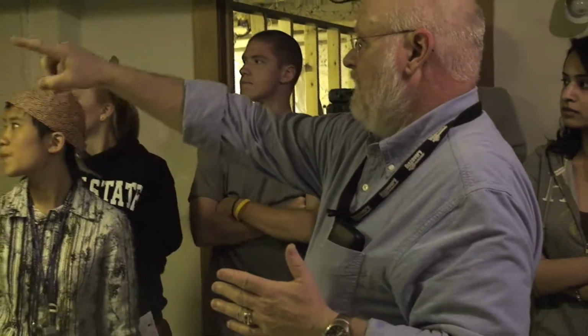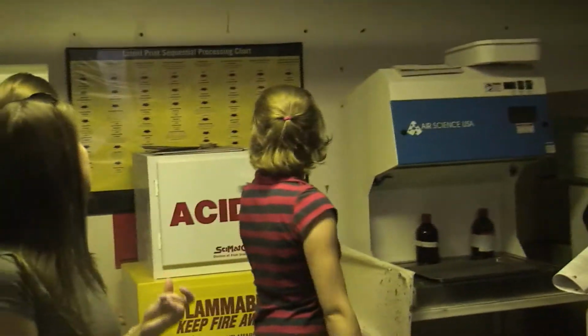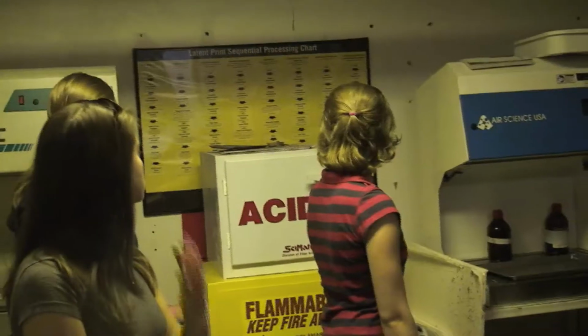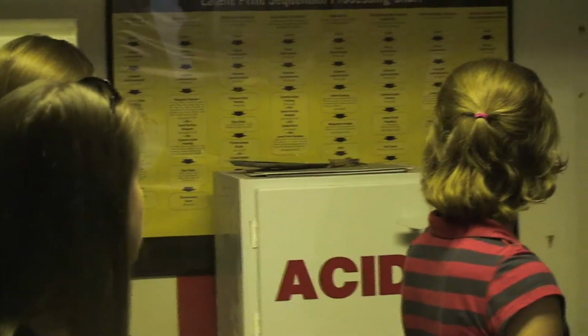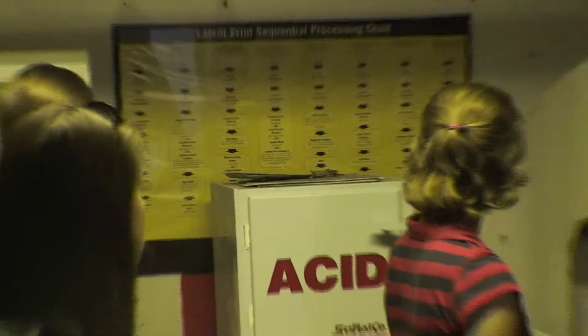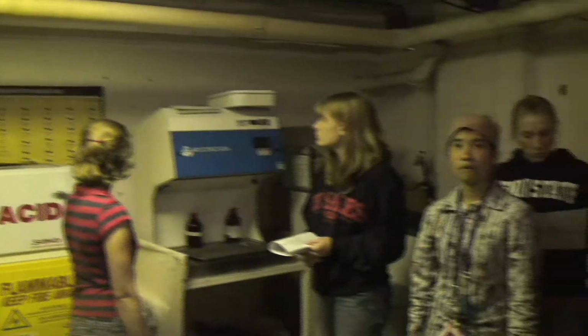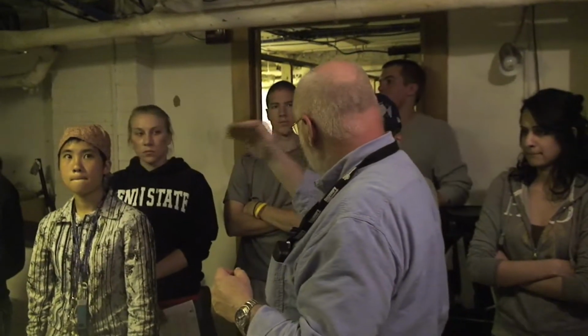There's a cascade that you can use, and if you look on that latent print sequential processing chart back there, you get an indication of the different kinds of reagents you can use for different kinds of surfaces. But generally, for porous surfaces, paper and cardboard, the first thing you're going to do is some sort of visual examination. You're probably not going to see anything, or you might, but you can shine a laser on it, or an alternate light source, and you might see some inherent fluorescence. But bottom line is you're going to start doing a sequence of things.